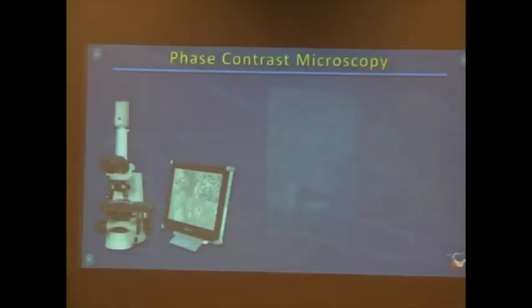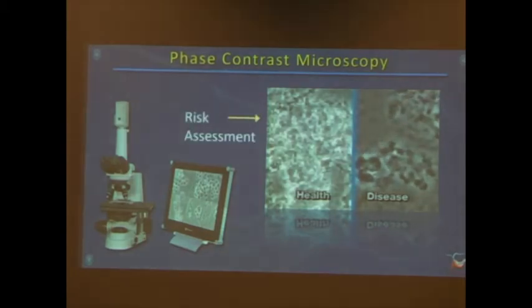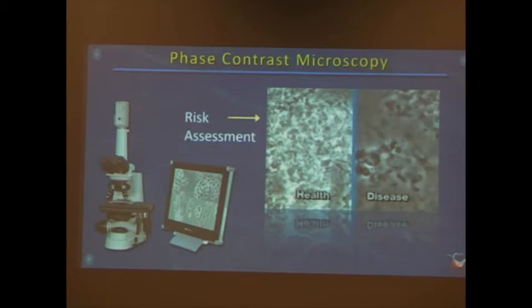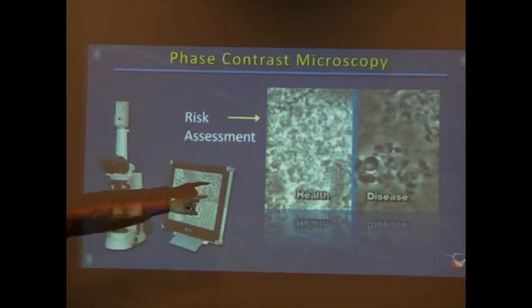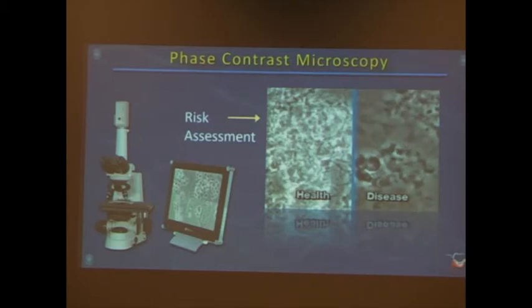I'll skip over these. We're doing pretty good on time yet. This is one of Dr. Paul Kise's original movies. So we've got a healthy field on the left and a diseased field on the right. You don't have to be a microbiologist to see there's something wrong here on the right-hand side.